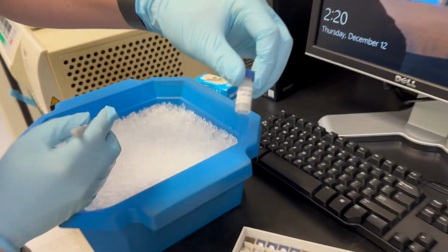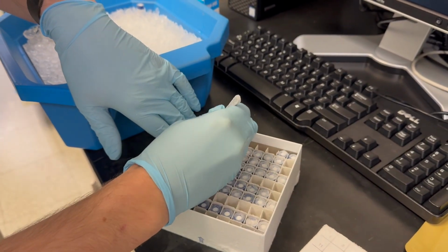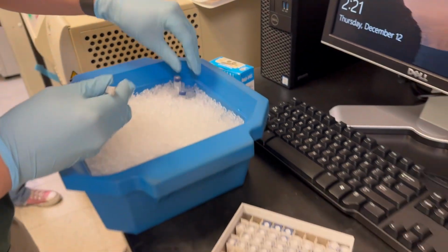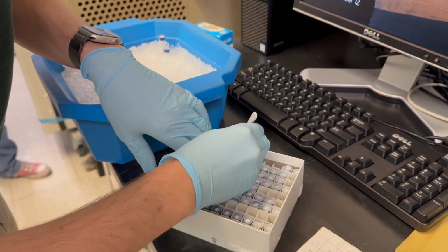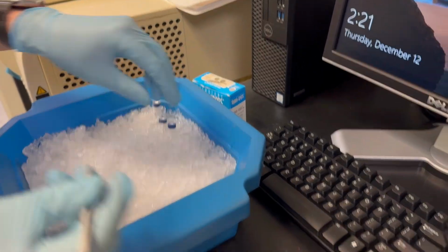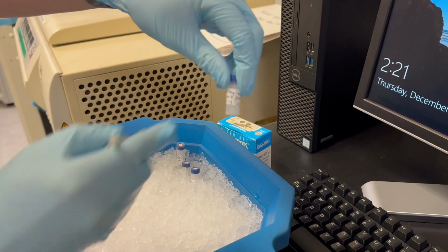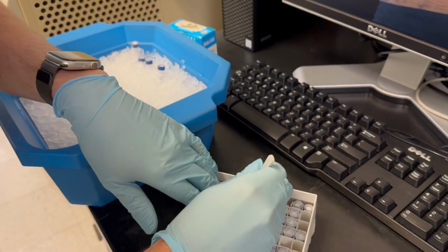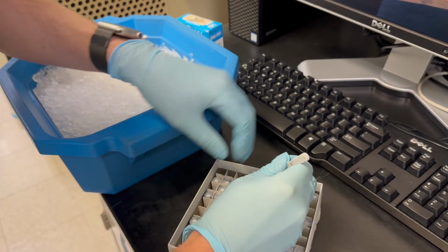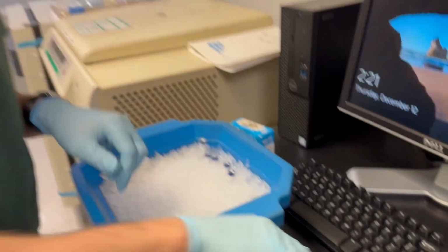You can see here we've got 0.1 mg per mL spinacidin. Putting metal tweezers in here was not my best idea. 0.1 mg per mL patuletin. 0.05 mg per mL jaceidin. That one's kind of hard to dissolve, so we had to go at a lower concentration. Quercetin 3-glucoside, this is what we quantify everything to. And I believe this is naringin or naringenin, 0.1 mg per mL. Okay, so that's our big five.